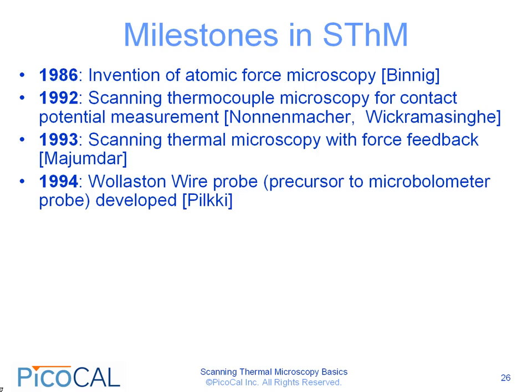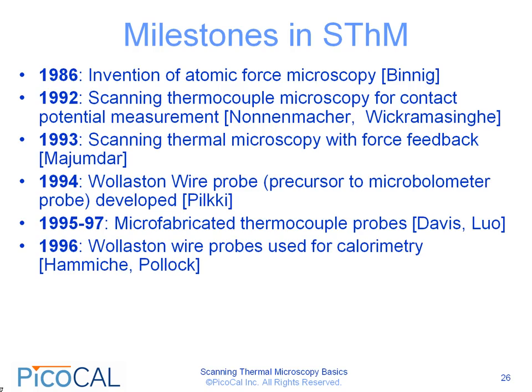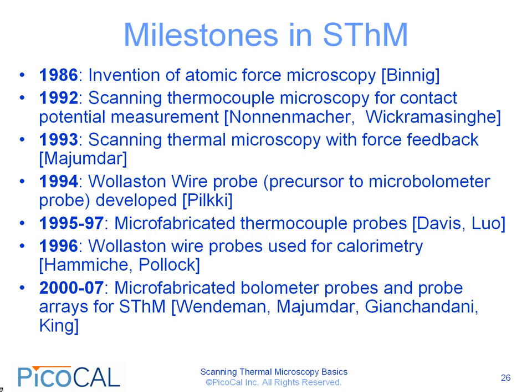1994 saw the development of the Wollaston wire probe, which was essentially the precursor to the microbolometer probe. From 1995 to 1997, the first microfabricated probes were developed, and these were thermocouple probes developed by Davis and Luo. The Wollaston wire probes, which were developed in 1994, were first used for calorimetry by Hammiche and Pollock in 1996. From 2000 to 2007 saw a lot of research in the area of microfabricated bolometer probes and probe arrays as well. This work was done by a combination of researchers which included Wendeman, Majumdar, Gianchandani, and King.